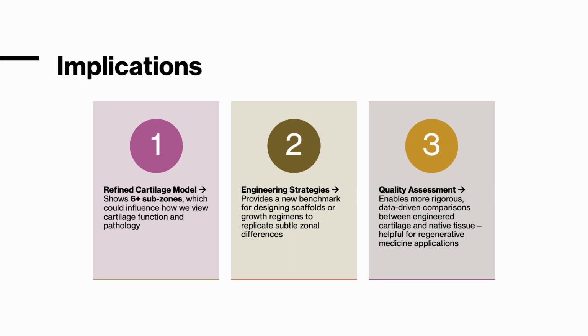Finally, the direct comparison of native to engineered tissues with a quantitative measure of zonal fidelity highlights that even if total biochemical content is similar, the spatial arrangement still needs to match the natural complexity for effective mechanical performance over time.